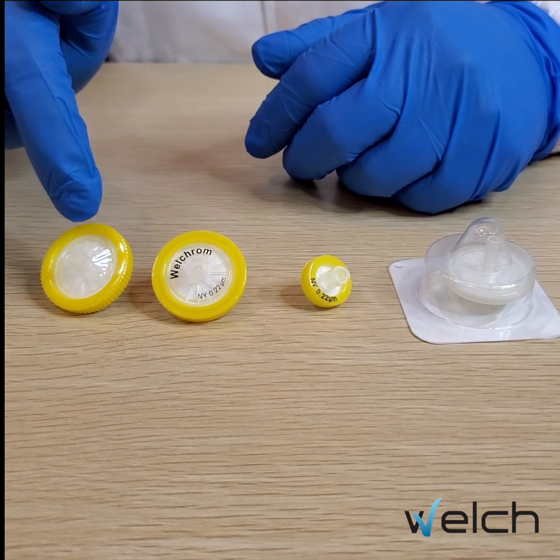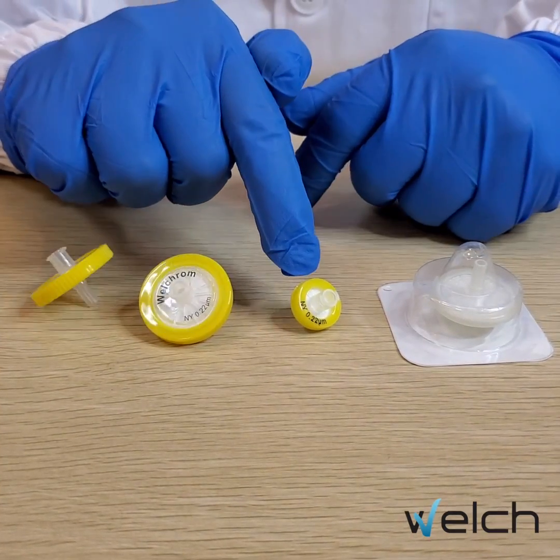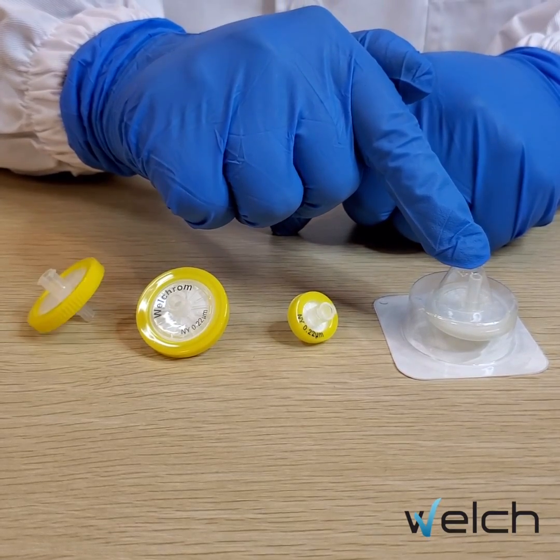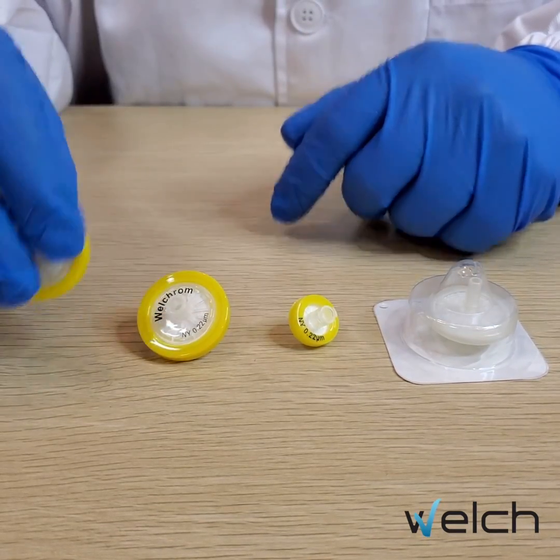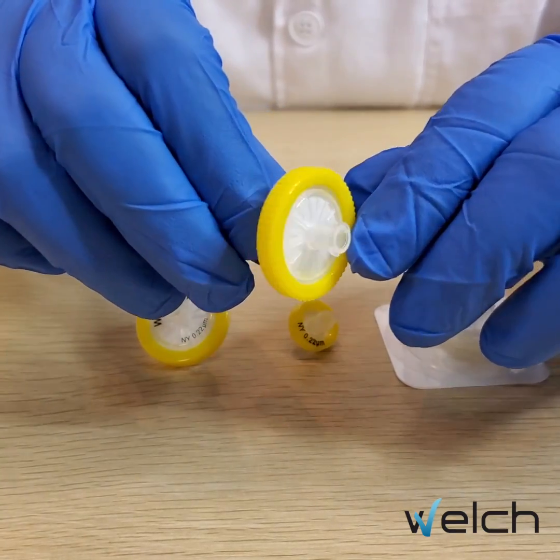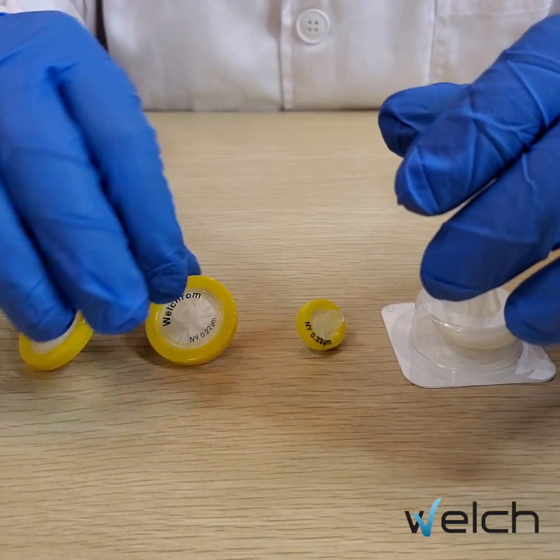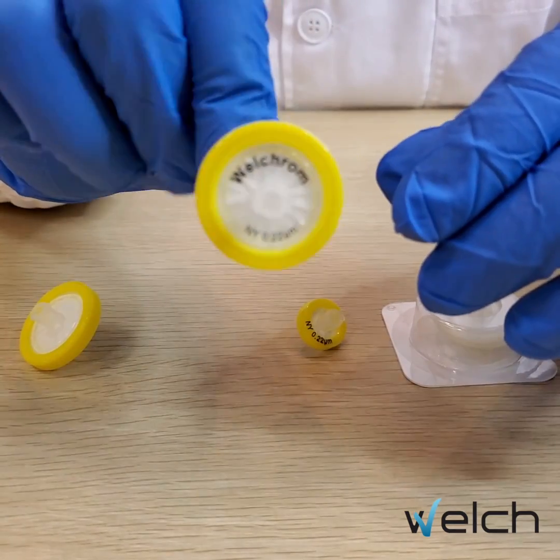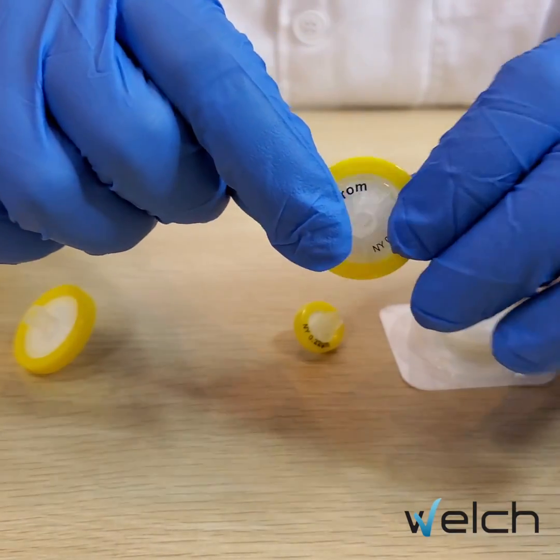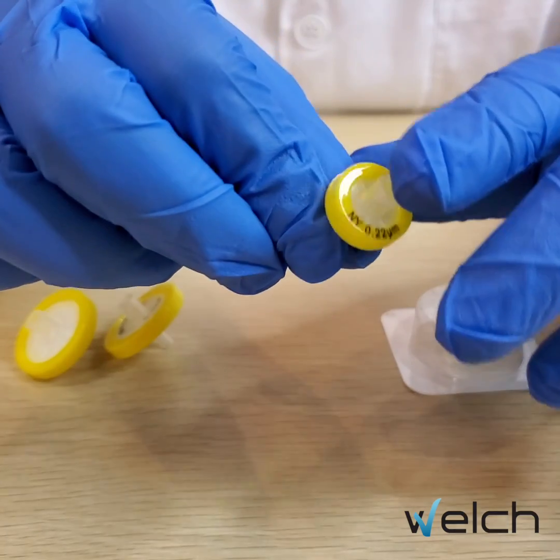As you can see, this is the economy syringe filter, this one is the general syringe filter, this one is the double layer, and this one is the single packed sterile syringe filter. The economy syringe filter doesn't have any printing on the body. The general syringe filter has the brand name printed on the body, and we can also customize the name.